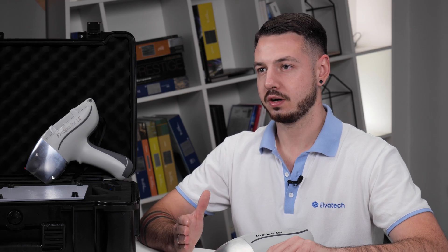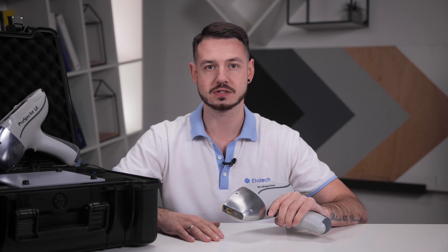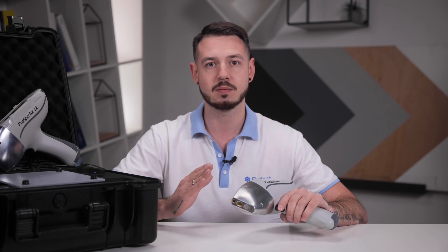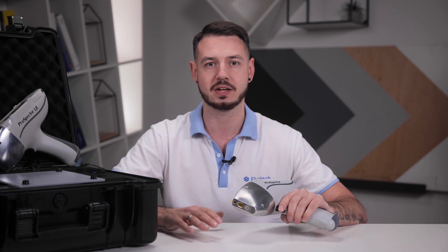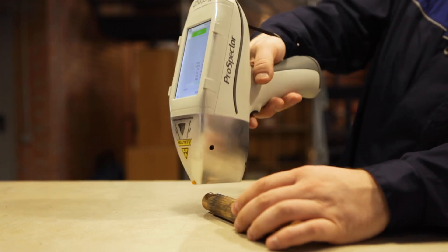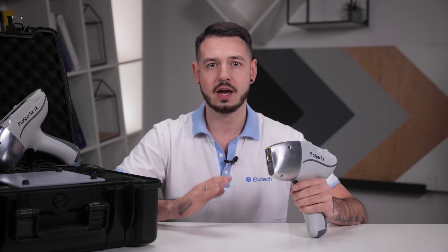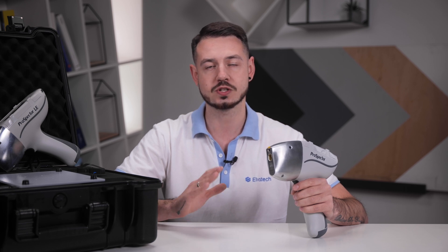The Prospector 2 is a reliable analyzer designed for stable and efficient operations. It features ambient temperature and pressure corrections for consistent performance and offers over 10 hours of battery life for extensive field work. This analyzer ensures safety and convenience with features like detector protection, easy replacement of protective film without tools, integrated barcode scanner for quick sample identification, advanced safety features such as an eye and air proximity sensor, and low count detection.